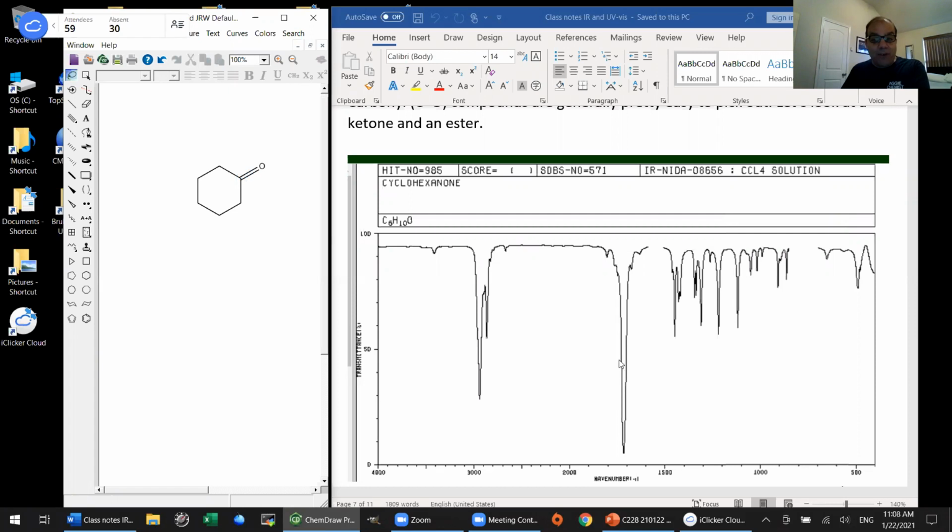The main feature of this spectrum is this extremely strong and broad peak. Shall we say that's 1720 or 1715 wave numbers, somewhere around in there. Very typical for ketones, for aldehydes, things like that. You could distinguish ketones from aldehydes from the aldehyde CH stretch, which I don't see here. I believe those are pretty strong and show up roundabout here somewhere.